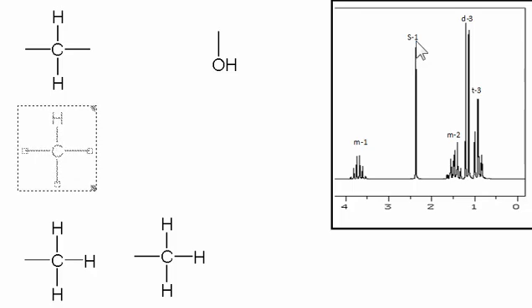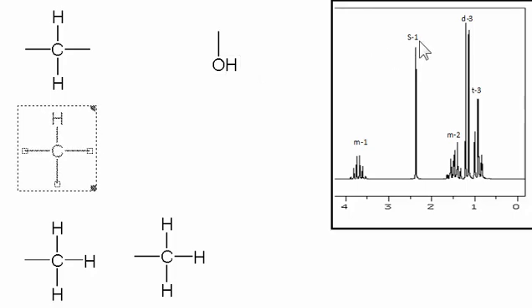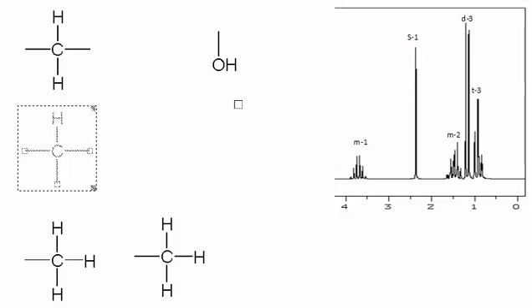And the only kinds of things that really show that, that is a singlet with 1 hydrogen, are alcohols, or occasionally alkenes with lots of degrees of substitution, anything with lots of degrees of substitution on it, where there's a single hydrogen on there. That's where you expect that kind of thing. We don't have any double bonds, but it is possible that we could have more degrees of substitution. So let's go ahead and look at how this might come together.